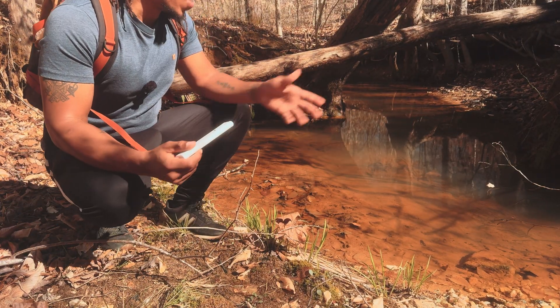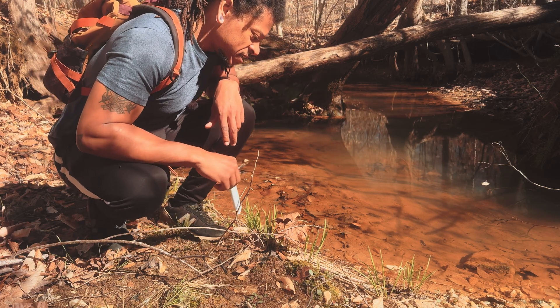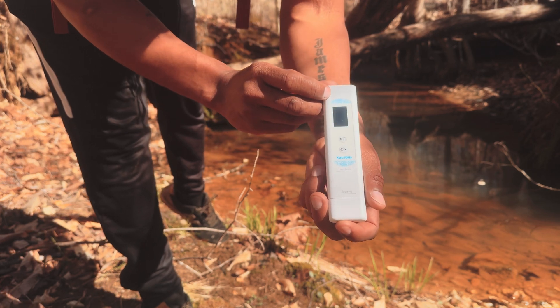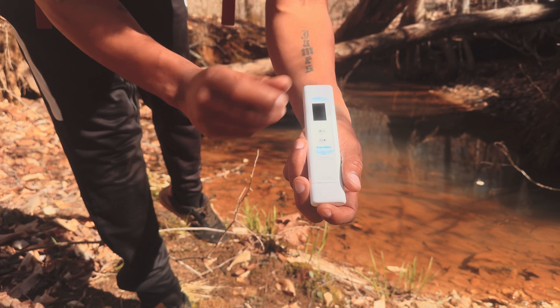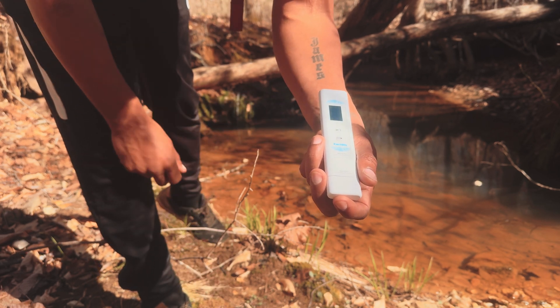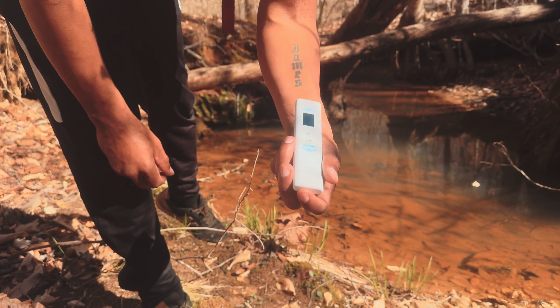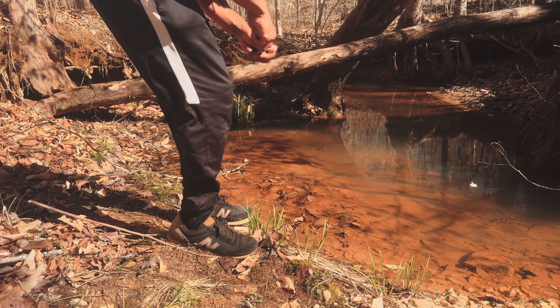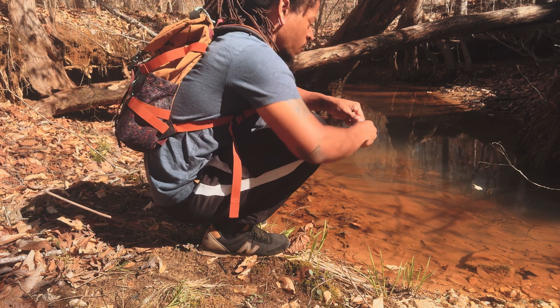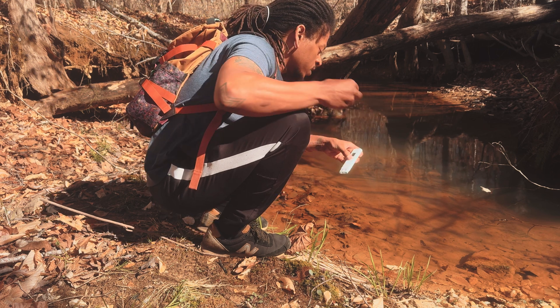Alright y'all, I'm out here at a wild creek in the middle of nowhere, Virginia, and we're going to test this water. I'm using the Cactole 6-in-1 water tester. This is a digital tester — you just stick it in and it's going to tell you a bunch of information about the water. There are farms around, so I'm pretty sure that's going to affect the water quality.